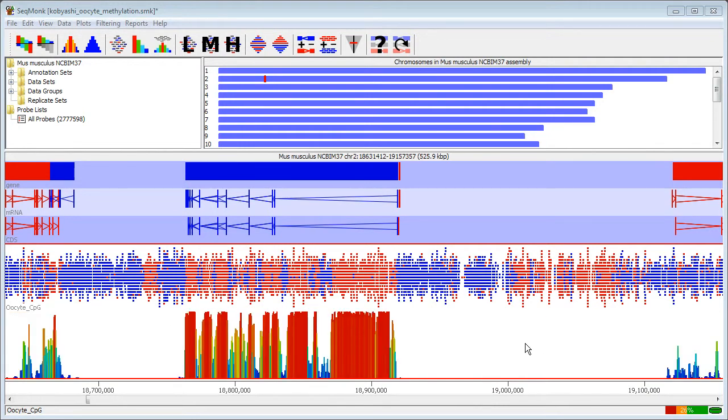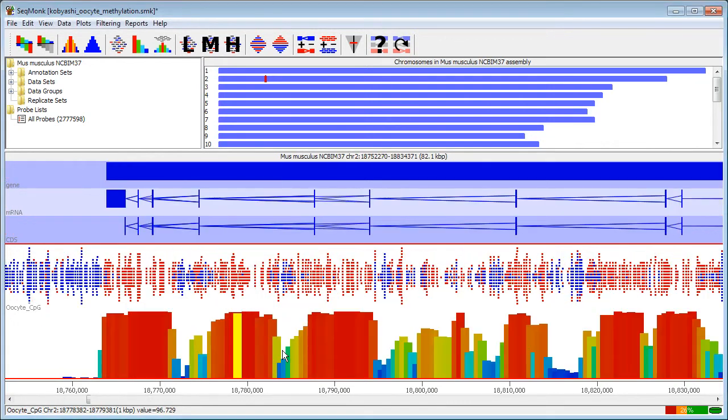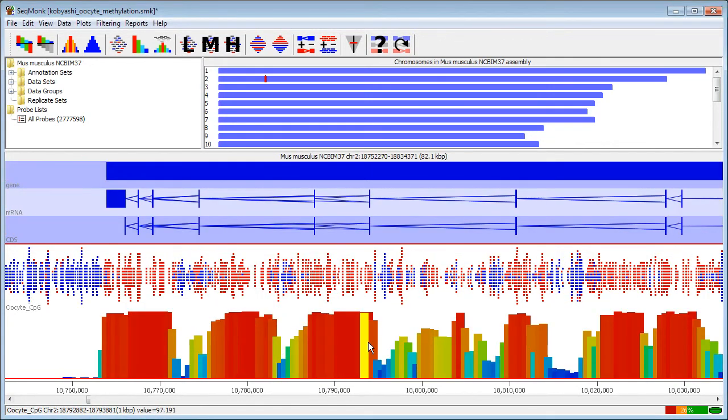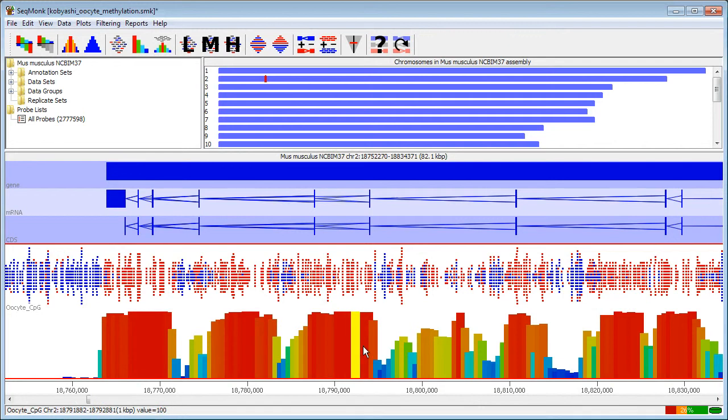Now that the quantitation is complete you can see that I have a set of tiled probes over all my genes plus and minus 5 Kb and that these are now quantitated with a percentage methylation.